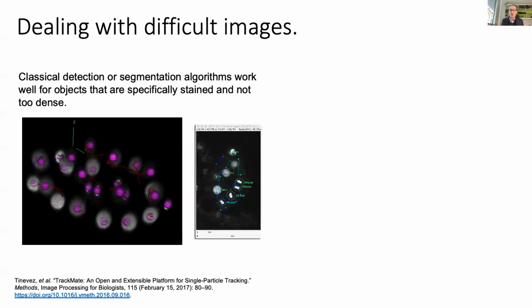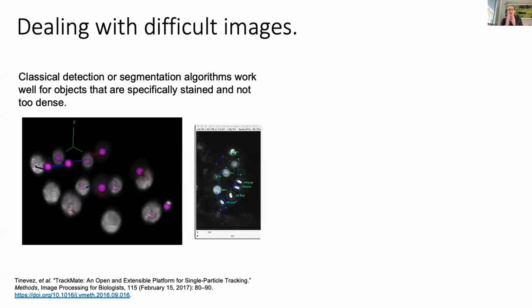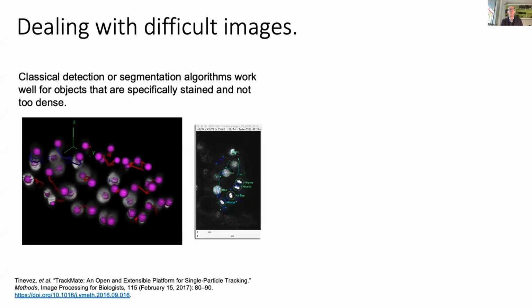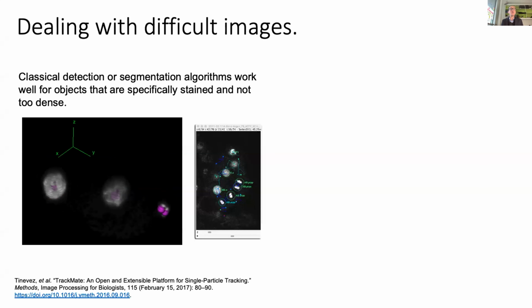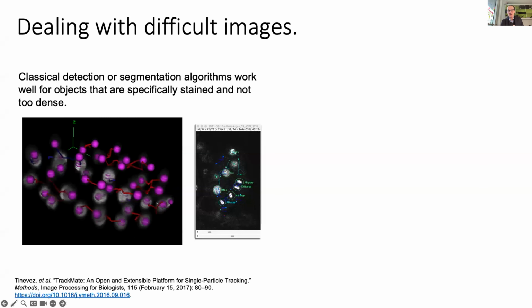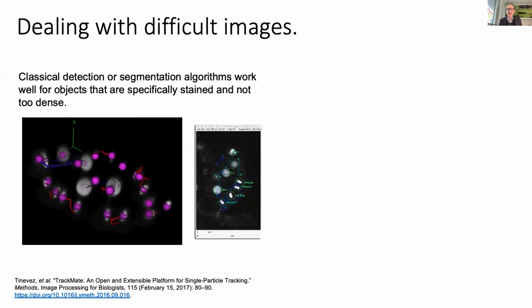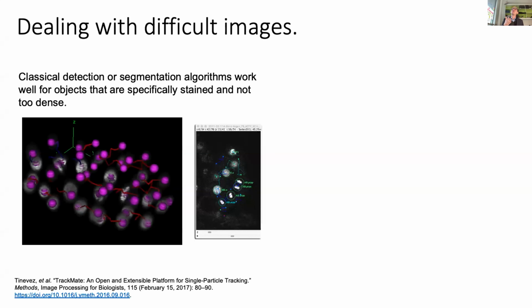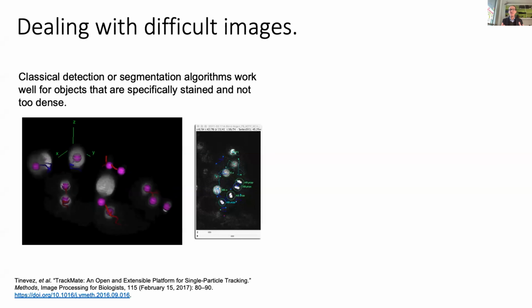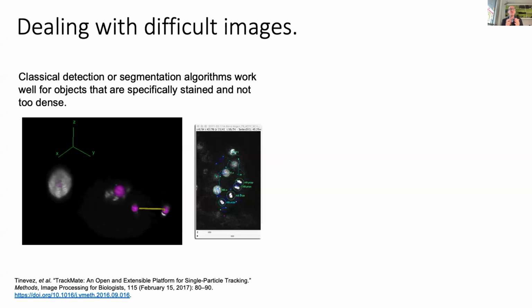So nowadays, when you speak about classical image analysis algorithms, people think about non-artificial intelligence algorithms and so on. And the classical algorithms are typically very good when you have the images I introduced. For instance, if you have an image that is sparse where objects are bright over a black background, they are doing fine.